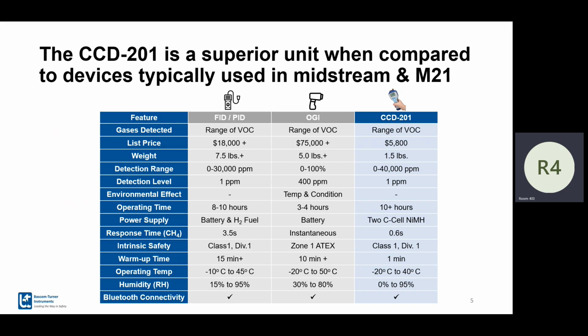Questions on the unit and technology? Yes, sir. How many gases can you calibrate to at once? Eloy, how many gases can we calibrate to at once? Different types of gases or different span points? At this point, it's two, because our response is linear. It actually makes no difference technically, unless regulation requires it. We could add that, but we'll show you data that it makes no difference.